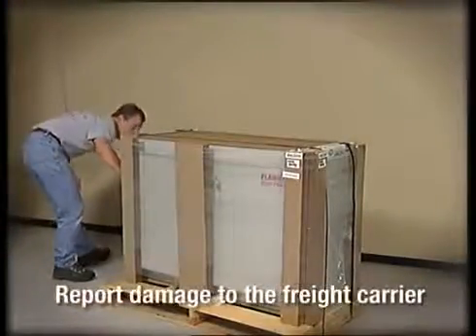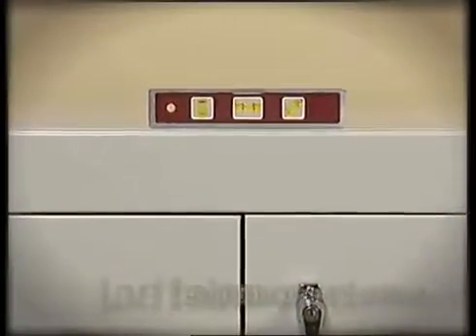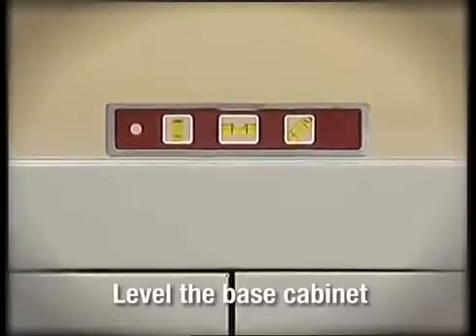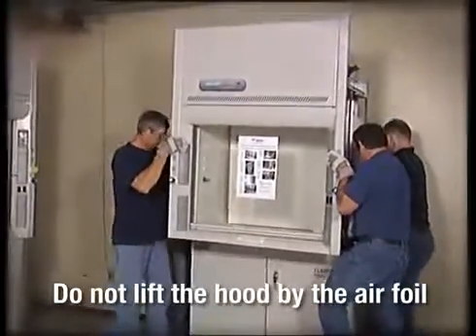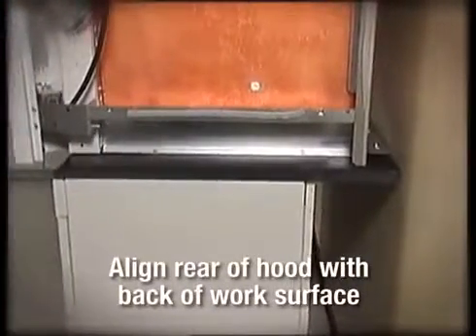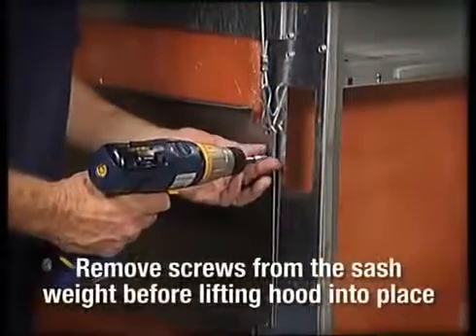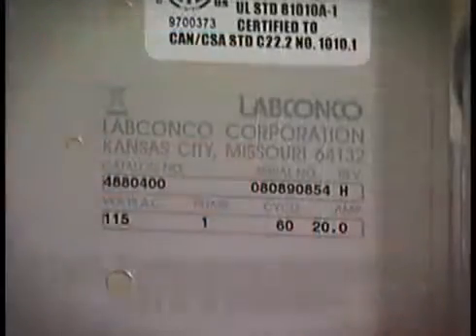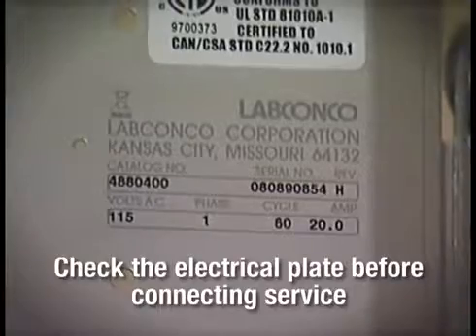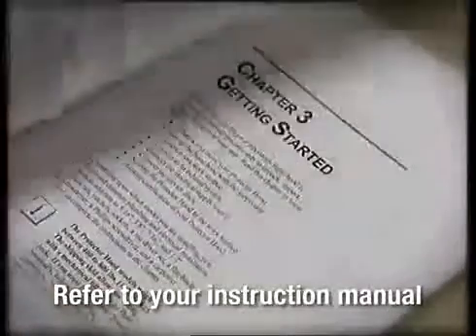Remember to inspect the carton and products and report any damage to your freight carrier immediately. Leveling the base cabinet is essential for proper hood operation. When lifting the hood superstructure, avoid lifting by the airfoil. Align the rear of the fume hood with the back of the work surface to provide the appropriate overhang at the front of the hood. The sash weight is secured to the back of the hood for shipping — be sure to remove the screws before lifting the hood into place. Always check the electrical plate for information about your hood before connecting any electrical service. Refer to your instruction manual for complete installation instructions.